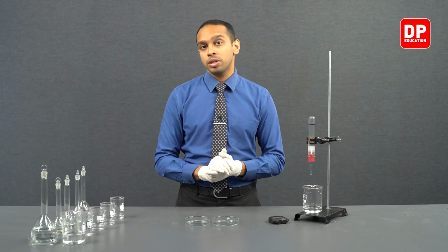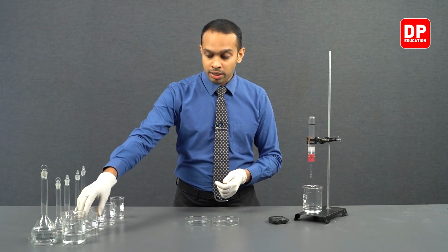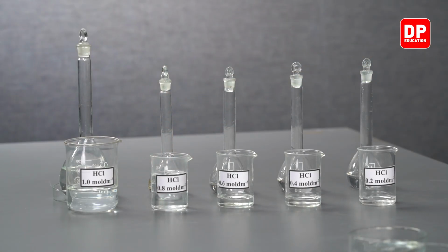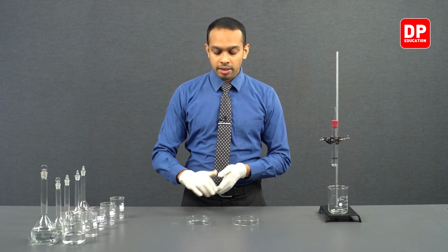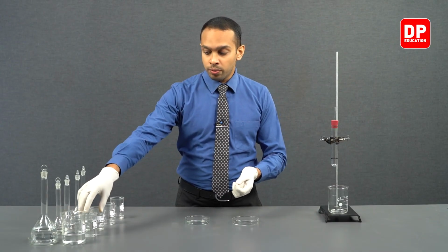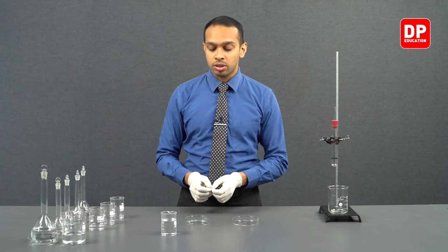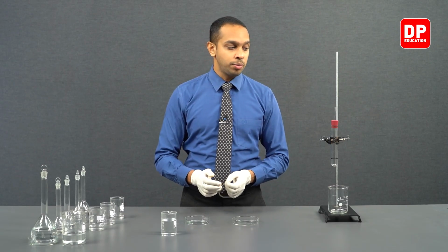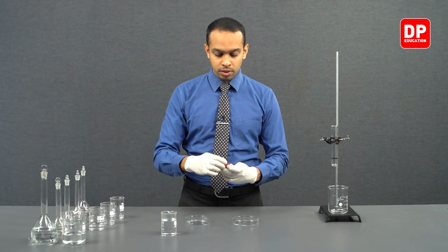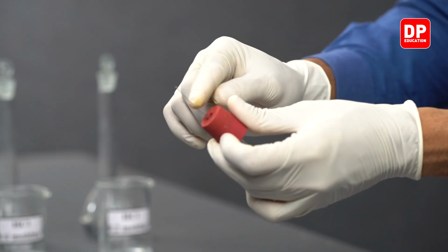So let's note down these times and move on to our fourth experiment, where we'll be reacting magnesium with 0.8 moles per decimeter cubed concentrated HCl. Now we are going to react another magnesium metal piece with 0.8 moles per decimeter cubed concentrated HCl solution. We'll be following the same steps. We'll take the rubber stopper, place the magnesium strip on the rubber stopper securely, as you can see.